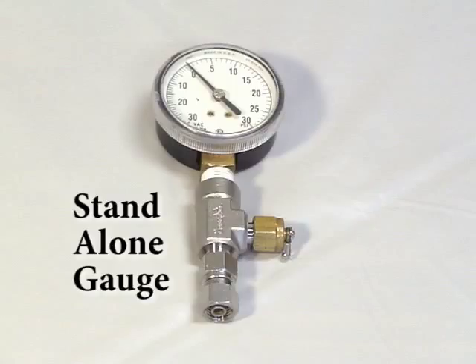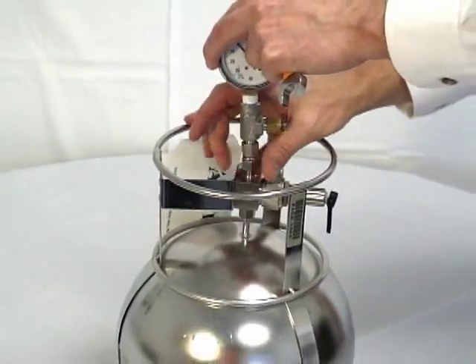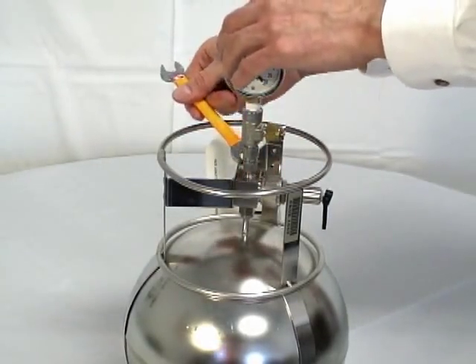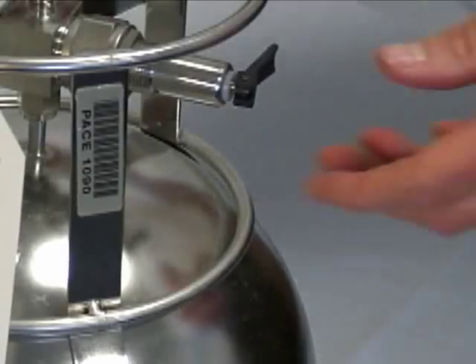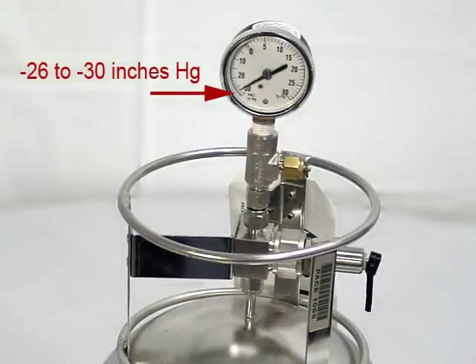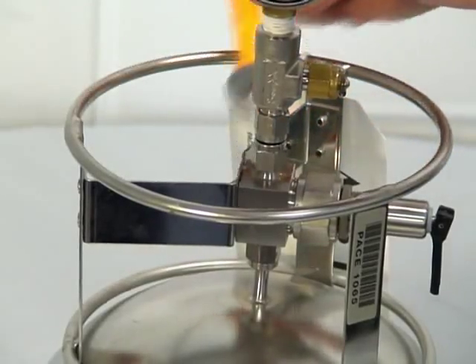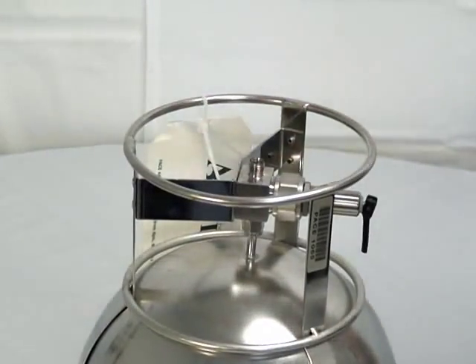Otherwise, move on to the next step of connecting the tubing and fittings. To attach the vacuum gauge, first finger tighten the swage lock nut and then use the 9/16-inch wrench to make the connection leak tight. Open and close the valve quickly to achieve a vacuum reading on the gauge. Depending on the atmospheric conditions, the reading should be between minus 26 and minus 30 inches of mercury. After obtaining the reading and ensuring the valve is closed, you must remove the gauge with the wrench and move on to connecting the tubing and fittings for sampling as required.